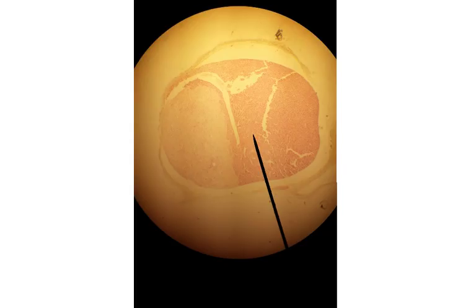There is another structure that we can't really see on this slide. It would come from this posterior region right here. It's a stalk that would connect to the hypothalamus. And that stalk is called the infundibulum. And the infundibulum is mostly more of those axons that travel from the hypothalamus into the posterior pituitary.